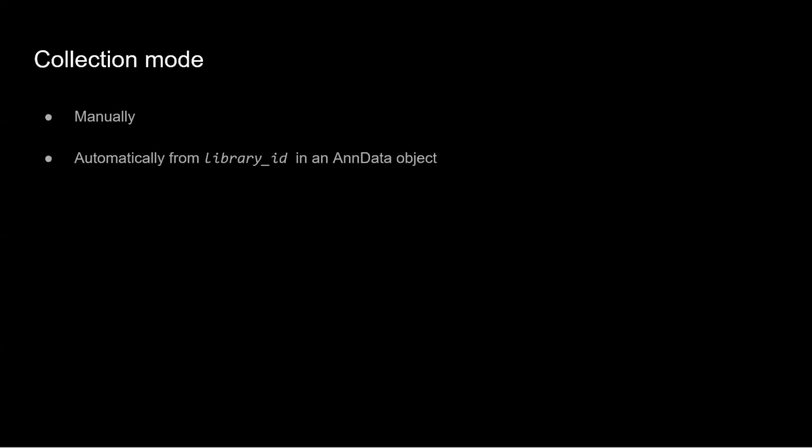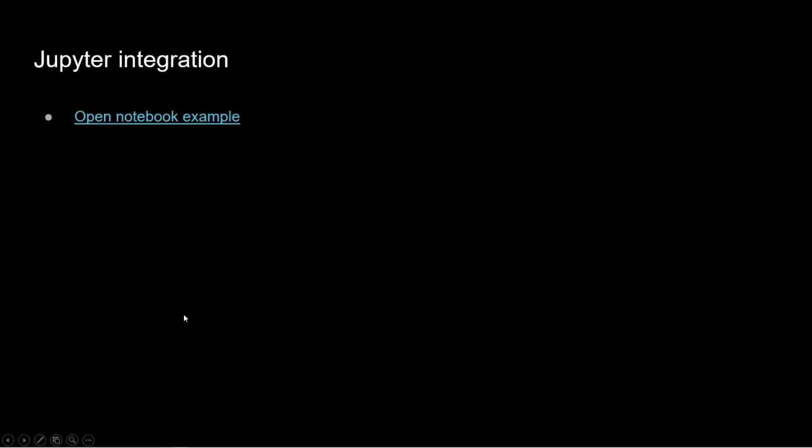Okay, so that was about the new feature, and the last thing I wanted to show you was how to integrate with Jupyter Notebook. So I created a small notebook example here. So if I load it in the browser, I hope it will work. Yes.